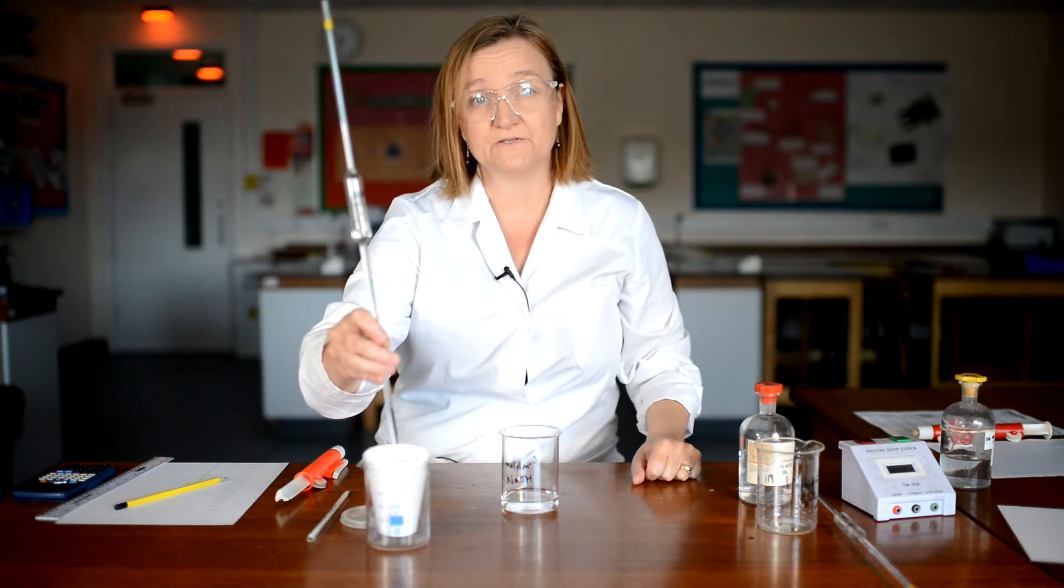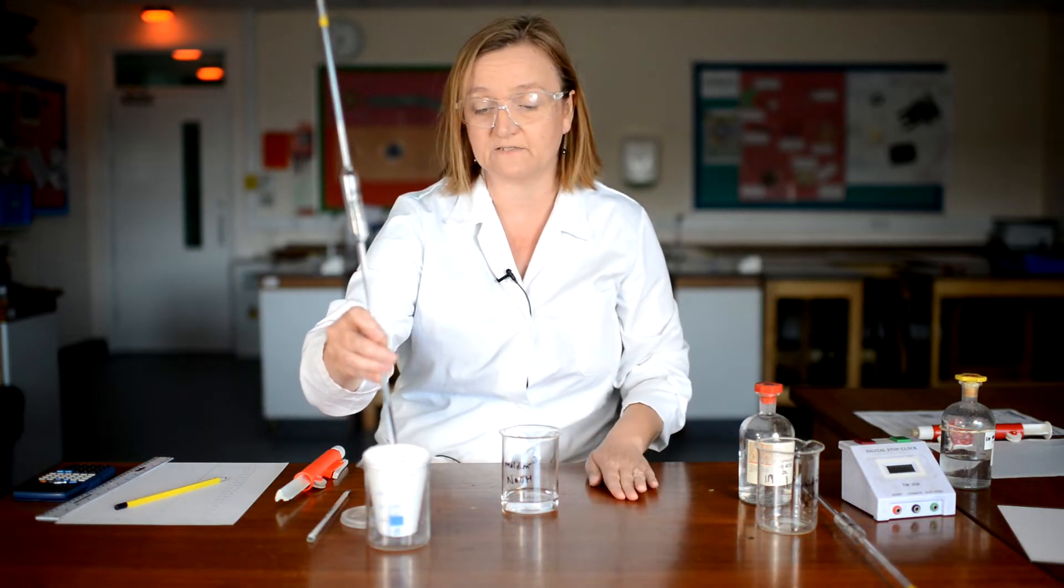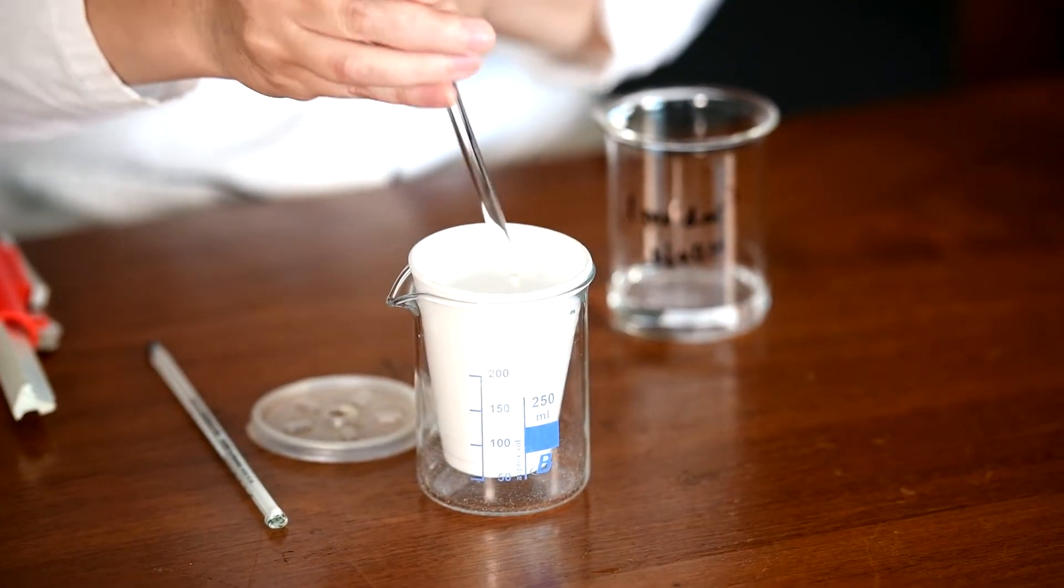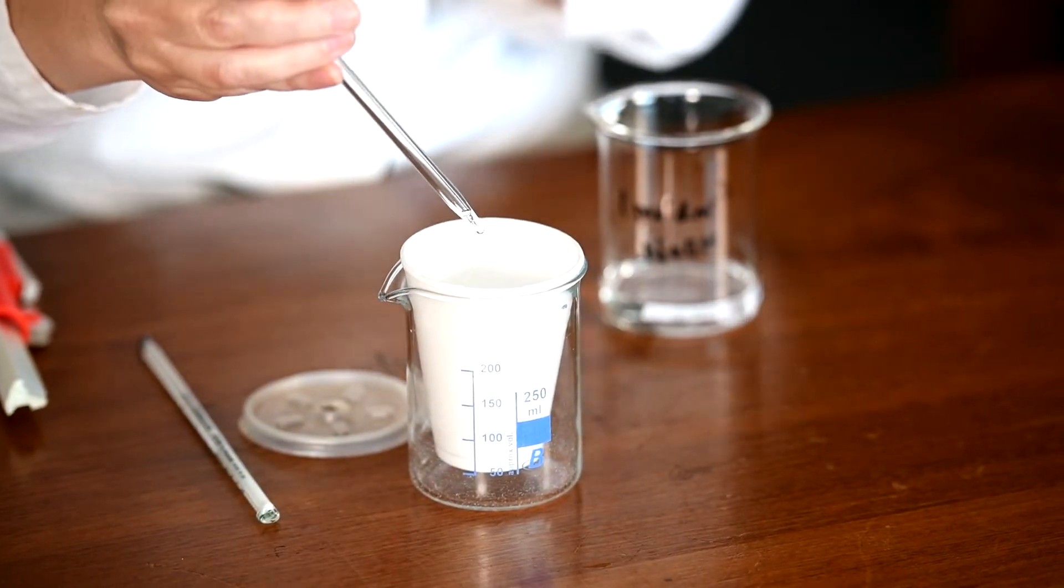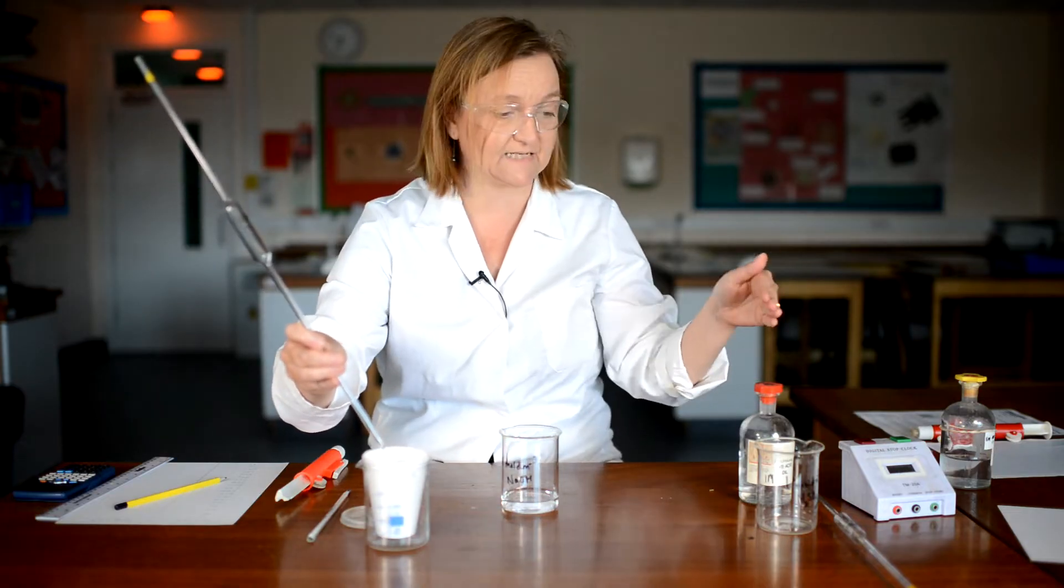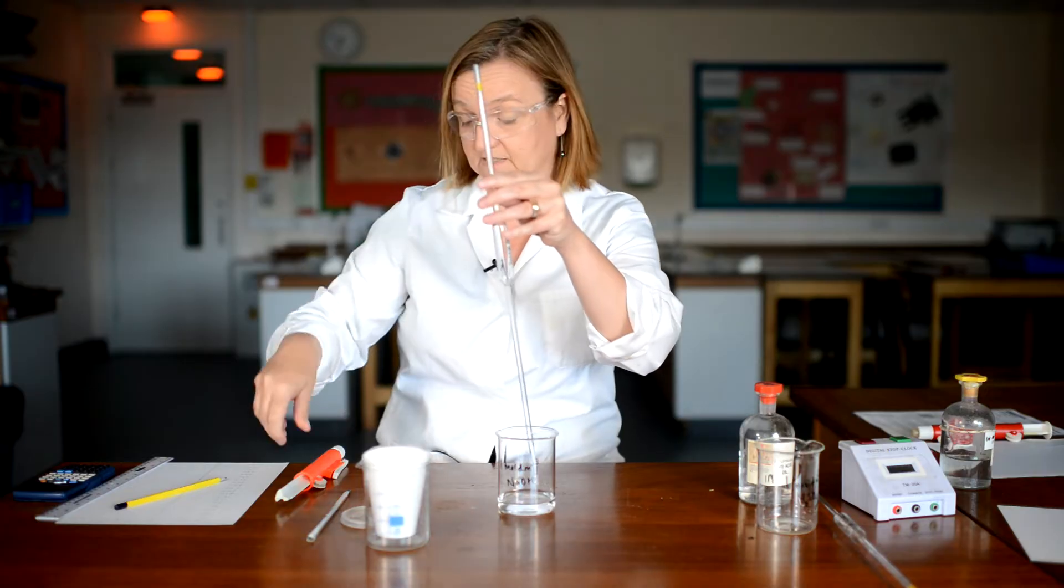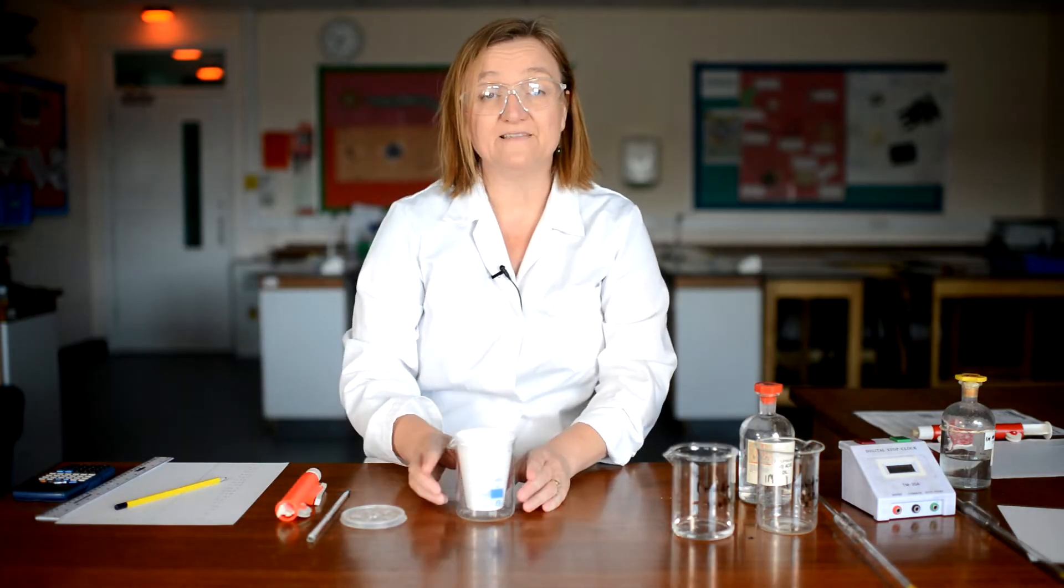Now of course when you use a pipette like this you don't want to blow the last piece of sodium hydroxide out because when the piece of glassware was made that little bit in there has been accounted for. So I've added exactly 20 centimetres cubed but remembering the stoichiometry, I need to have twice as much sodium hydroxide so I'll do that again. So I've now got 40 centimetres cubed of my one molar sodium hydroxide in my polystyrene cup.